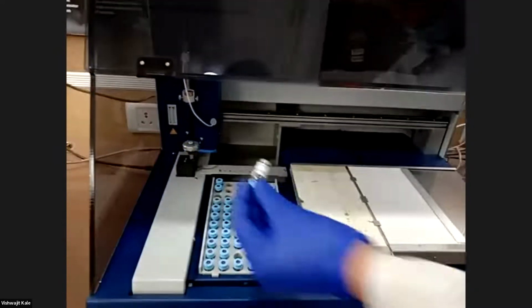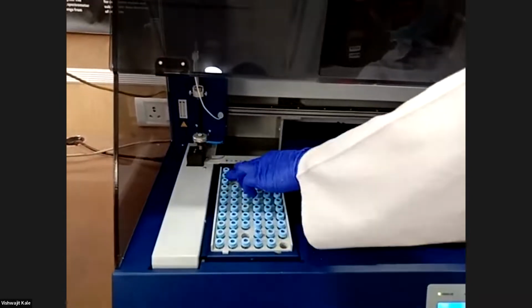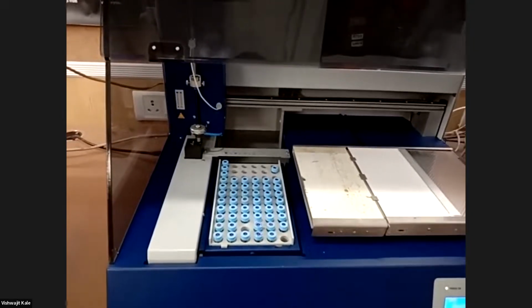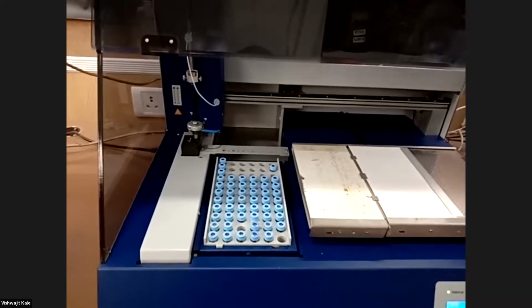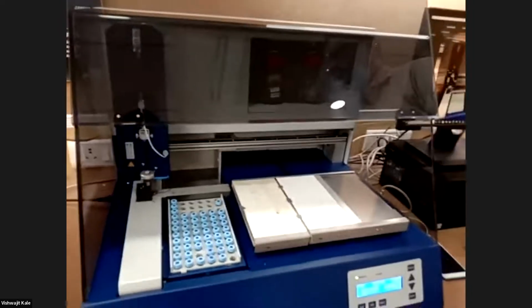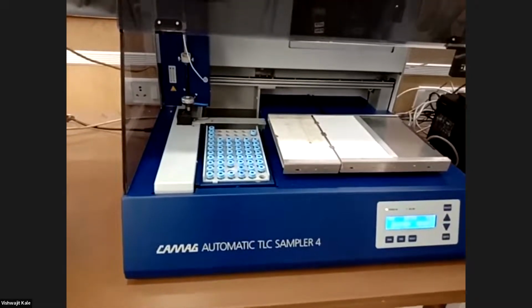And now I have already kept all the samples here, which we are going to analyze today for detecting antioxidant compounds. I have kept 3 samples in this position. What are the samples? Samples are some plant samples like Emblica officinalis, because I wanted to show you positive results. So we have selected some good plants which contain antioxidant compounds. Any reference? We have used references like ICMR and HPTLC Association methods. We are applying gallic acid standard along with Emblica officinalis to find out the bioactivity, because gallic acid has very good antioxidant properties and is present in Emblica officinalis. Definitely we can observe some bands after the DPPH assay, which will give us positive results for antioxidant compounds.